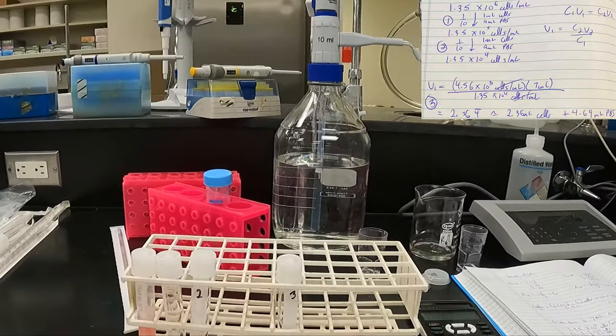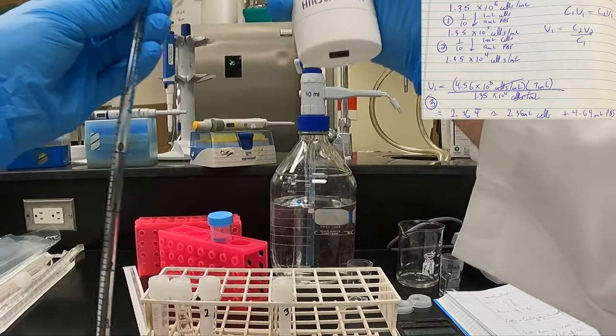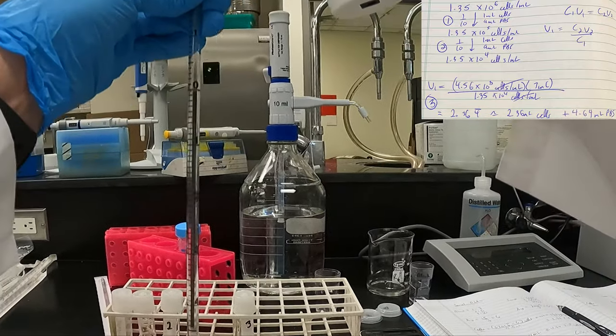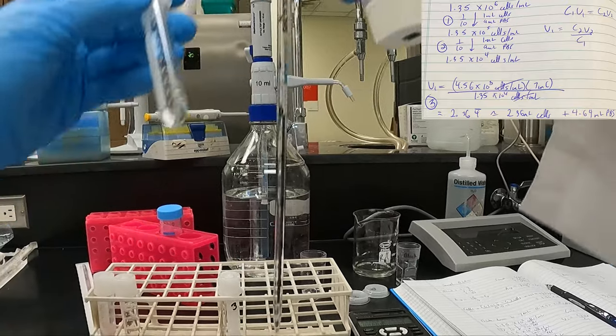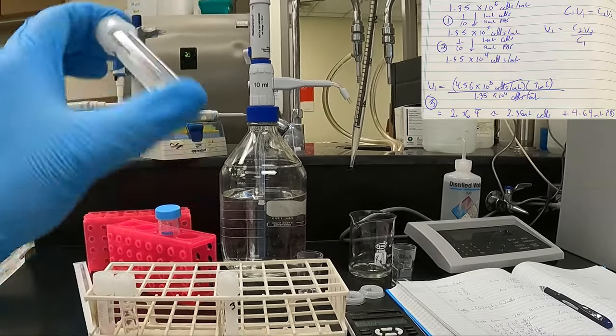Now we have our final tube, tube number 3. I'm going to take 2.36 mils. The 2 and the 3, no problem. The last number 6 will be a guess, somewhere between the 0.3 and 0.4. Again, make sure we mix it thoroughly.